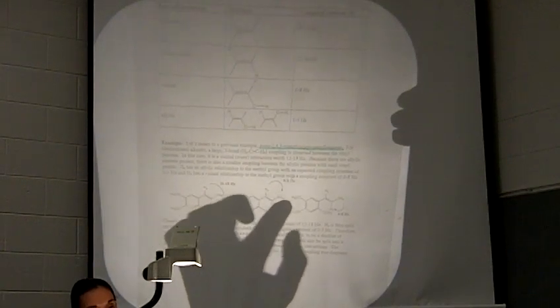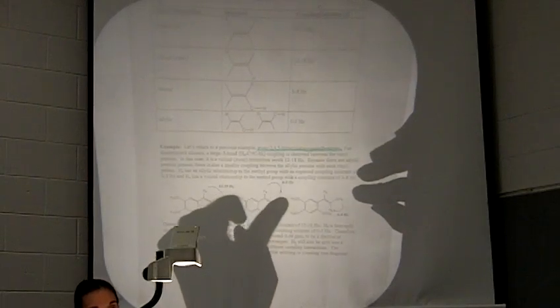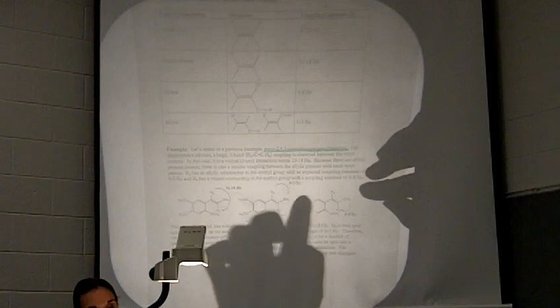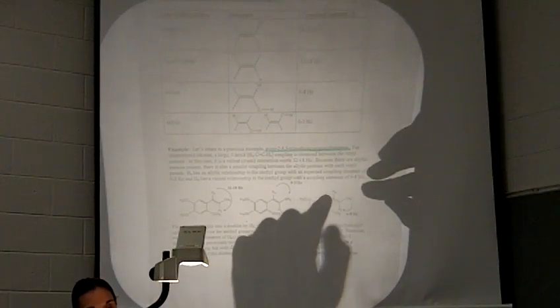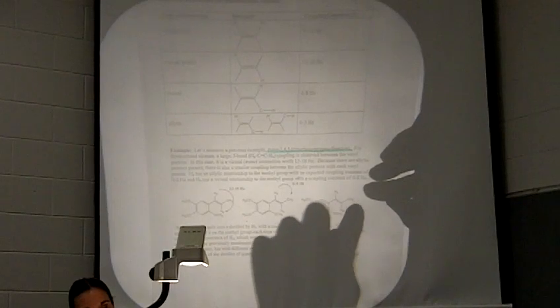HA has a relationship to this methyl group that's allylic, because it's HA, then carbon, carbon, carbon, and then these protons that are involved will cause some coupling interactions on HA. That's a 0 to 3 hertz interaction. Versus HB and this methyl group, which is the same side of the double bond, but without going across. HB has a vicinal relationship, so that relationship is stronger. It's 6 to 8 hertz.